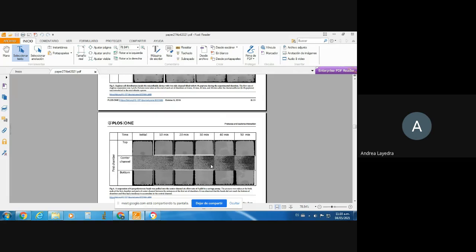More beads accumulate in the central channel directly between the entrances. This could explain why a higher concentration of Euglena is observed in the top chambers. Also, these observations could be attributed to the uneven distribution of light on the microscope stage, since Euglena is photosensitive.